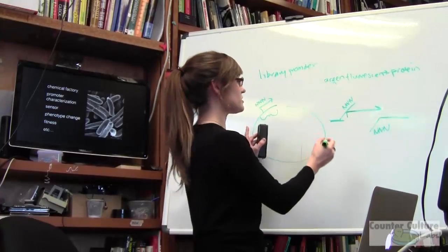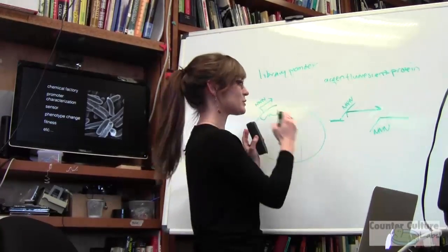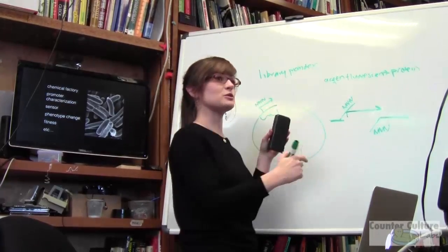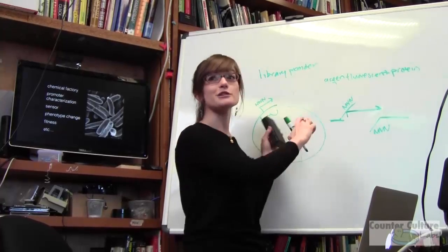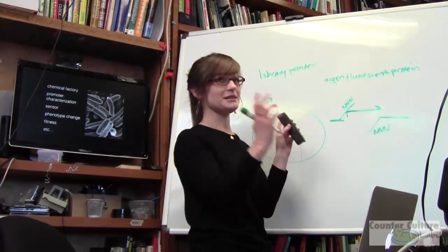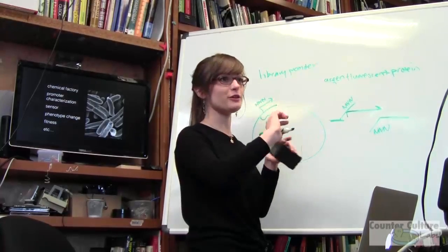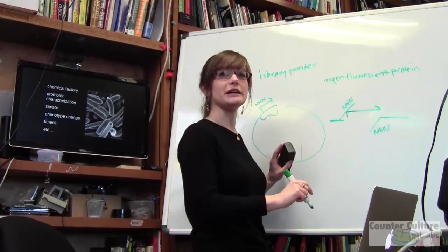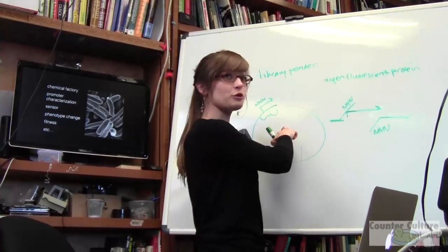Or what you can do is order oligos that have randomized regions in them, and you can anneal them and drop them into this region using restriction enzyme digest. There are various ways to make this happen. We'll talk about DNA synthesis in a little bit, but if you want to synthesize an entire gene, right now the going rate is about 20 cents per base pair. So it's still fairly expensive. But for the short promoter region, it's not.